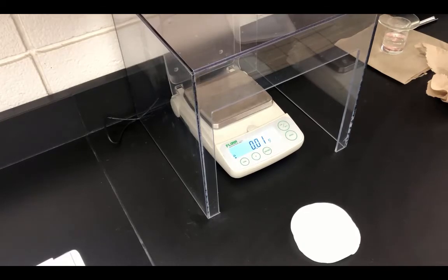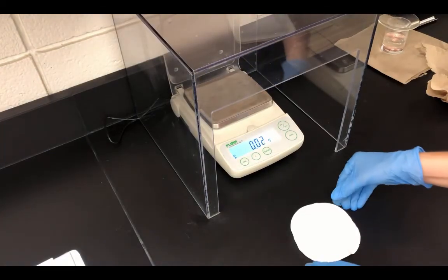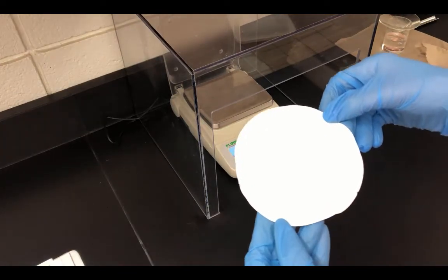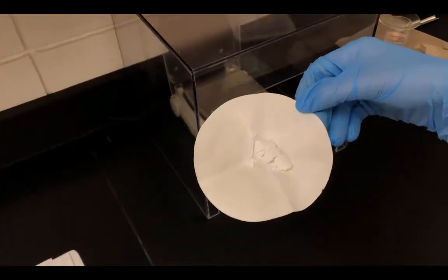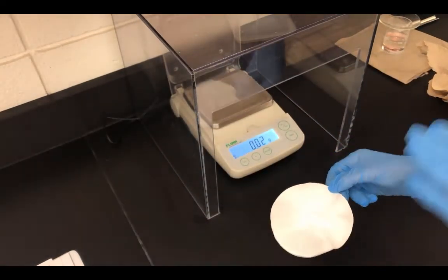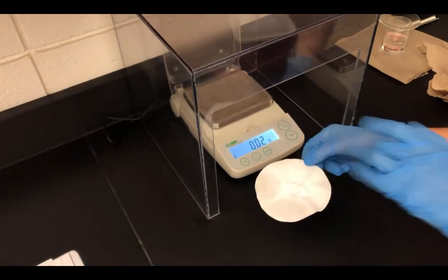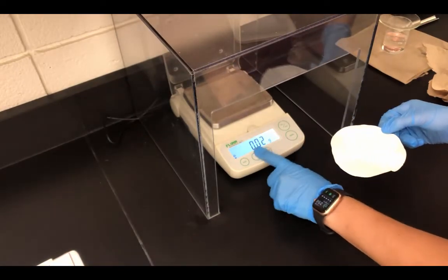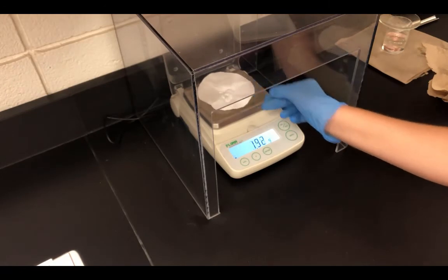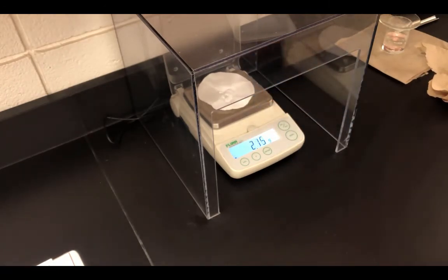I have removed the filter paper with the solid, so you can take a look at the solid. You can make your observations. And what I'm going to do is find the mass of the filter paper and the solid. So since the scale is not reading 0, I'm going to press 0. And I'm going to go ahead and put it on the scale.